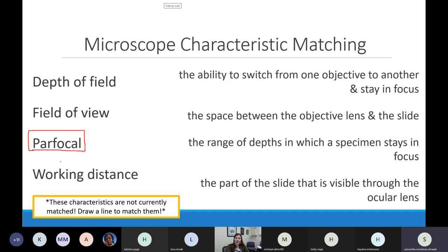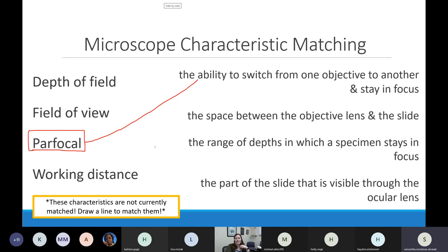In addition to being compound microscopes, our microscopes are also par focal. Par focal means that if I start with the scanning objective and get it in focus, when I go to the low power objective it will stay mostly in focus - I'll have to use the fine adjustment knob to fine-tune it, but it'll be mostly focused already. The same applies going up to the blue objective. Par focal microscopes save you a little trouble - focus it once, then just fine-tune from there.